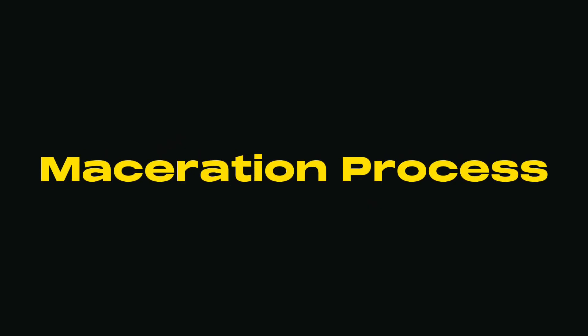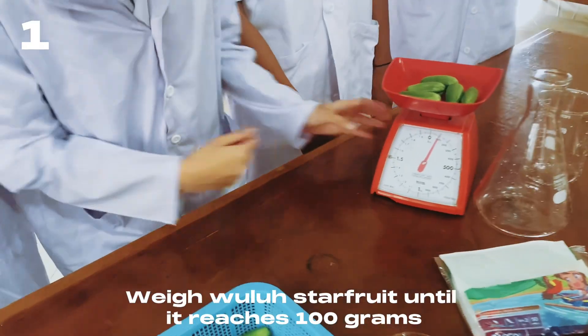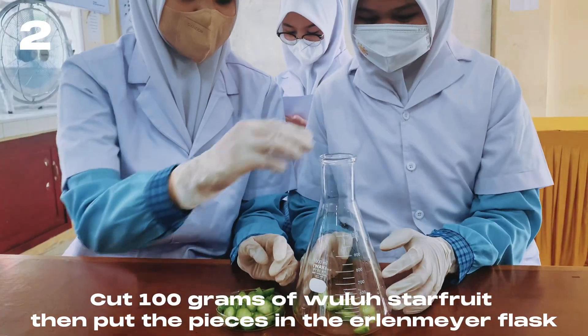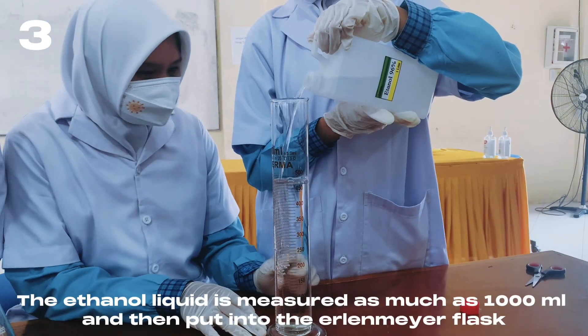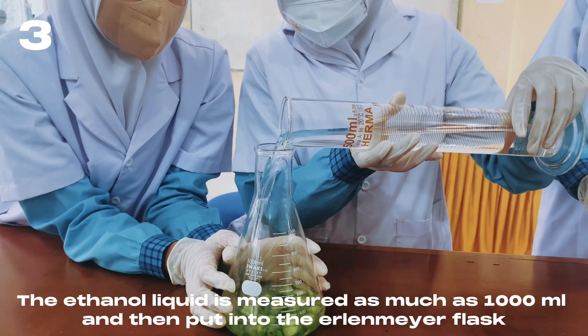Maceration Process: Weigh star fruit until it reaches 100 grams. Cut the 100 grams of star fruit, then put the pieces into the Erlenmeyer flask. The ethanol liquid is measured at 1000 ml and then added into the Erlenmeyer flask.